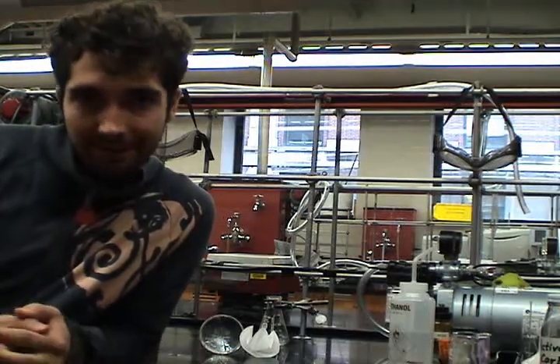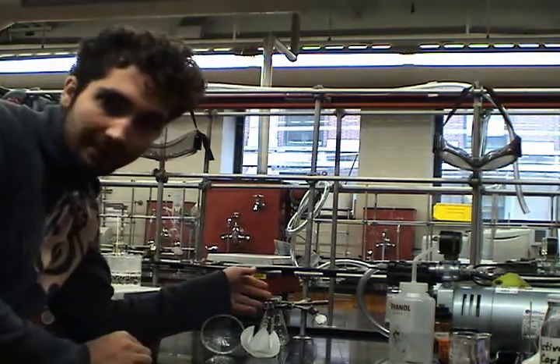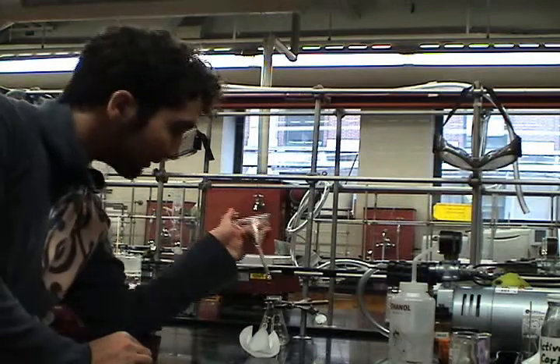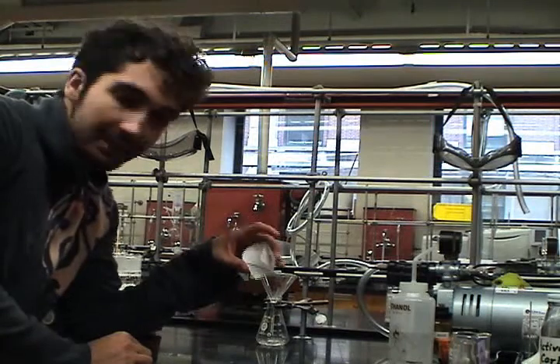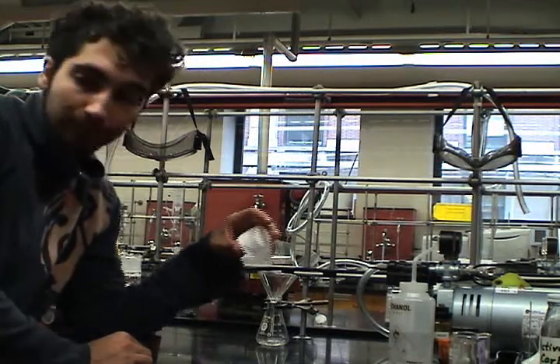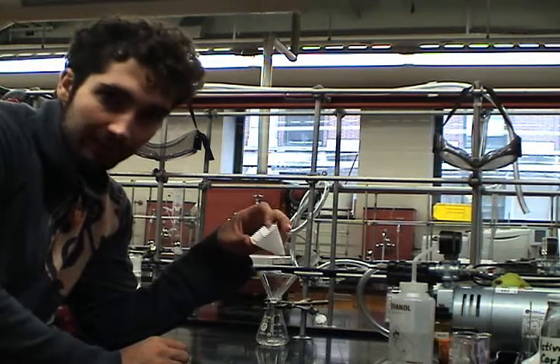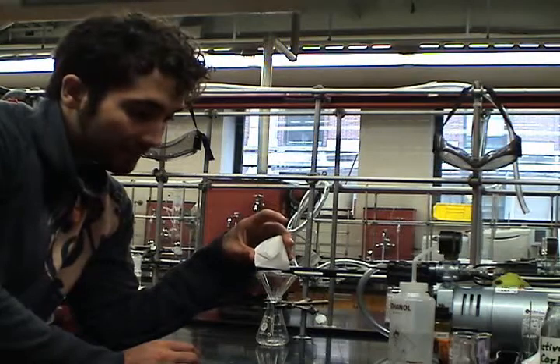The setup for hot gravity filtration really isn't that difficult. All you need is an Erlenmeyer flask, properly clamped so you don't break any glassware, your funnel, which you put into that Erlenmeyer flask, and a piece of properly fluted filter paper. We flute filter paper because it increases the surface area of the paper and therefore allows the solvent to filter through much more quickly. This saves you time and is therefore something you should learn.